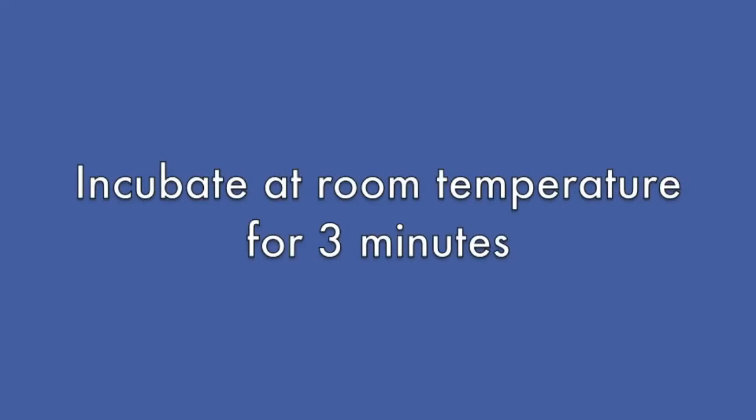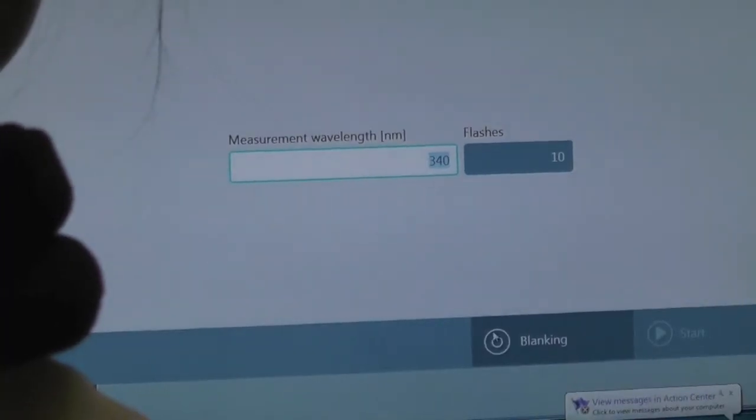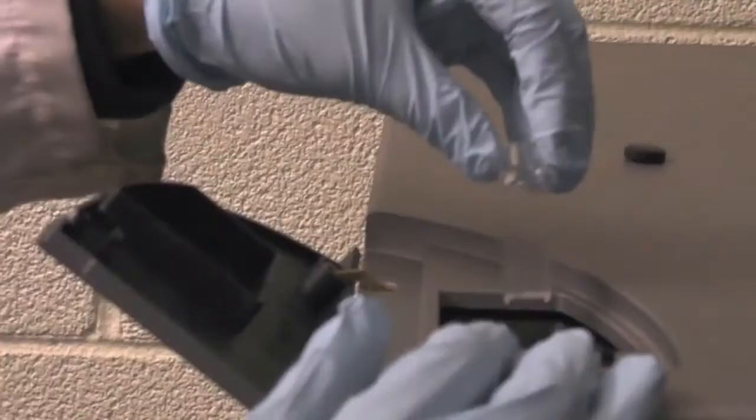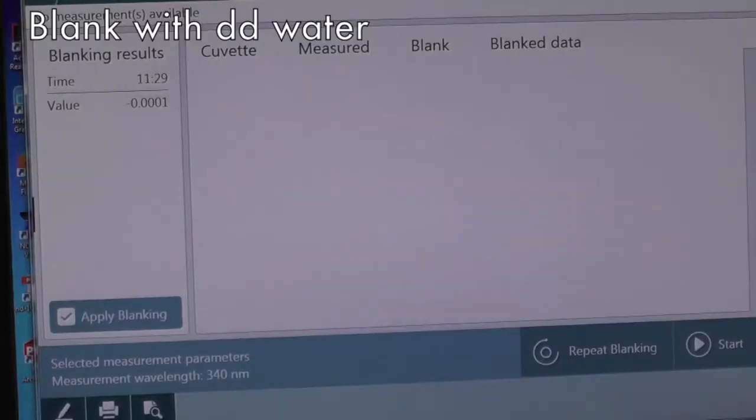Incubate for 3 minutes at room temperature, then read the absorbance at 340 nm using the Shimadzu spectrophotometer.